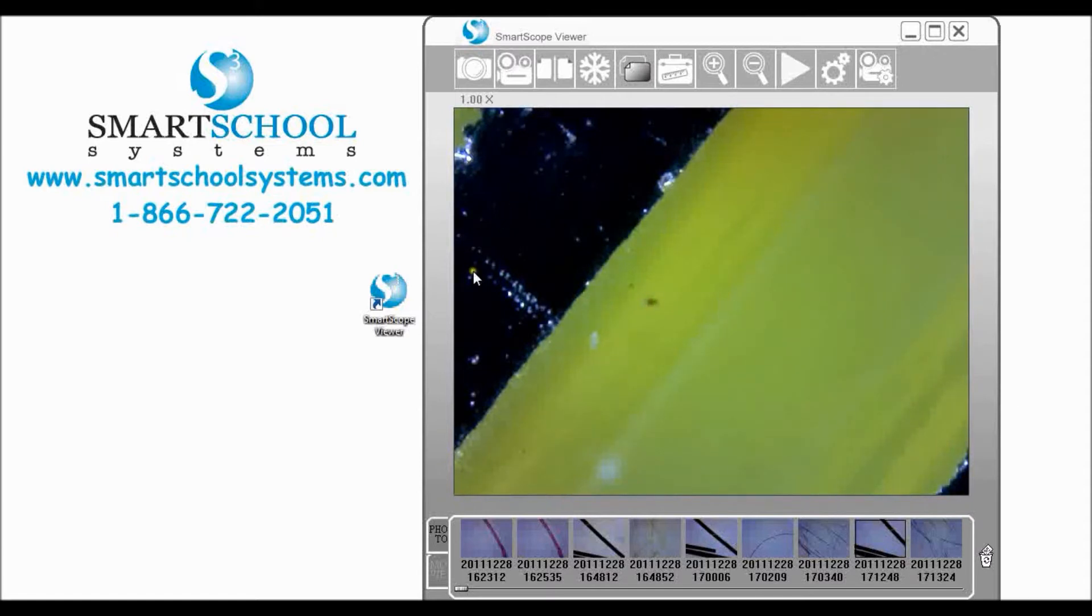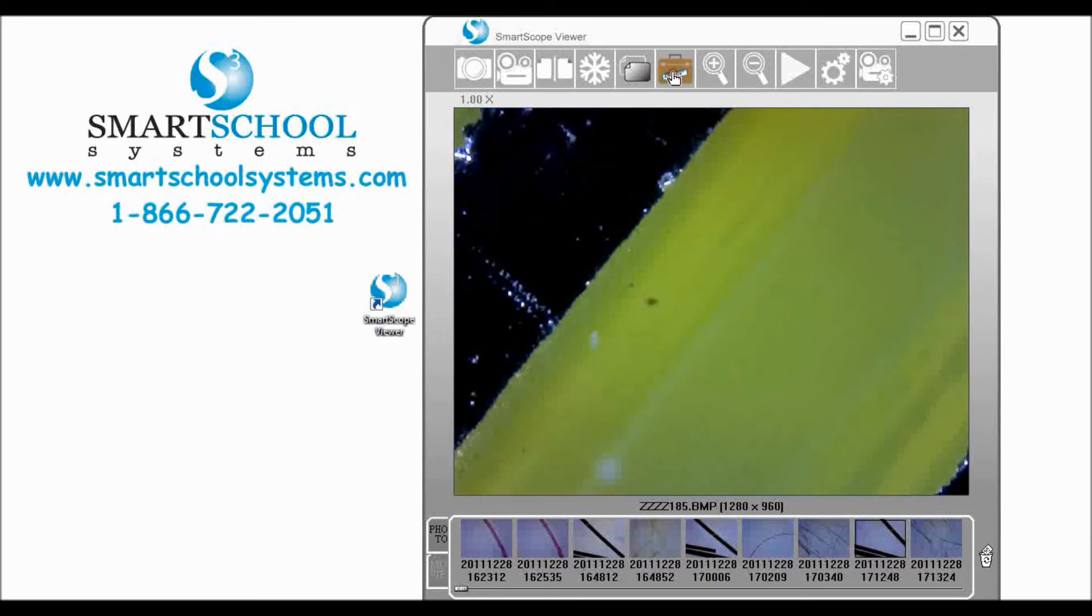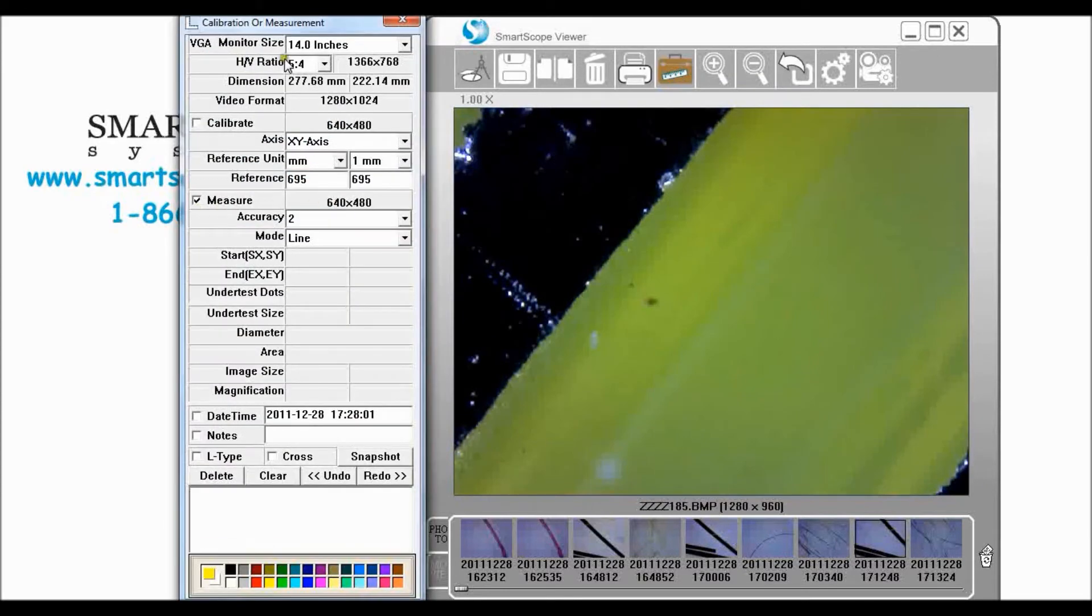What you'll want to do is once you get that into focus go ahead and click measurement, you see it open up.